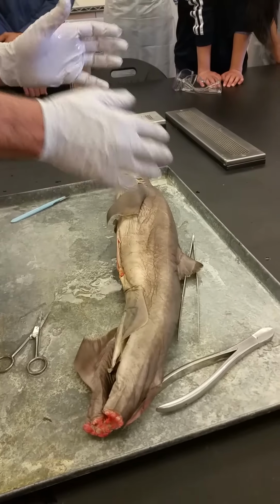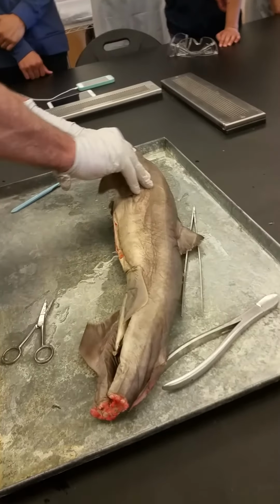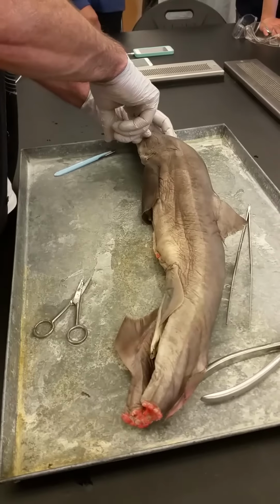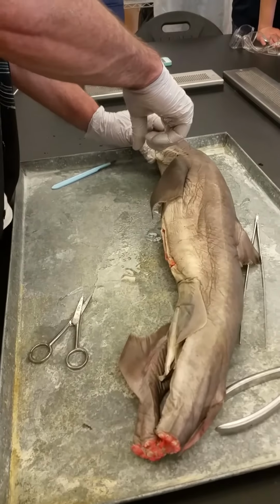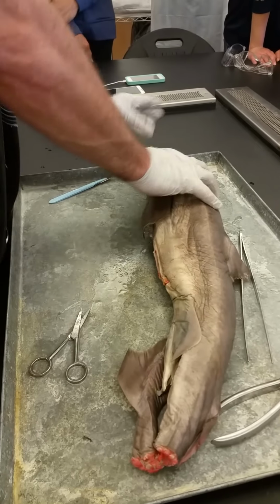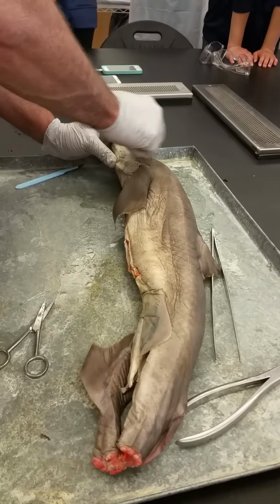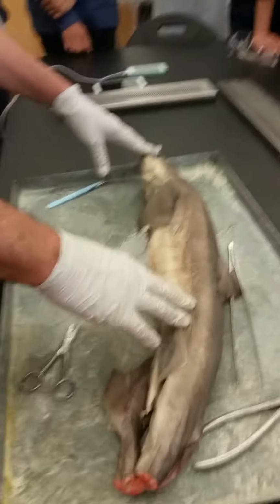So some people have this idea that sharks have to swim their whole life. That's not true for all sharks. Some of the bottom dwellers, the ones that sit on the bottom, particularly the rays, but even some of the sharks, have a 6th gill slit on the top of their head. It's called the spiracle, and that allows them to breathe without opening their mouth. So they can swim, keep their mouth closed, and keep themselves nice and streamlined in the water, or a ray sitting on the bottom where its mouth is in the sand can pump water in through the spiracle, over the gills, and out the gill slits. There are no gills associated with that slit. It goes to the gill chamber. They can ventilate their gills that way.